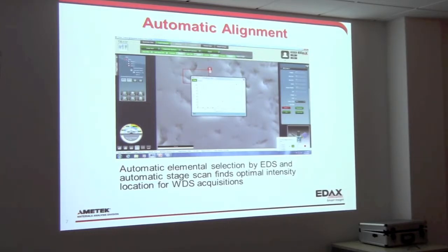These are all parameters that a dedicated microprobe operator knows, works with, understands, and does every single day. SEM operators tend not to know that. They're not specialists in WDS. They just want to come in, turn it on, have the system run, get WDS quality results out, and get their answers to get through. They're not dedicated operators. None of you are dedicated, very few of you, there's a couple, are dedicated WDS operators. You just want to use the power of WDS to get it done. So all of those other settings are built into the software behind the scenes that you as an operator should realize are there, but hopefully you rarely have to change those parameters. So it goes through and sets it, and that's because of the communication.